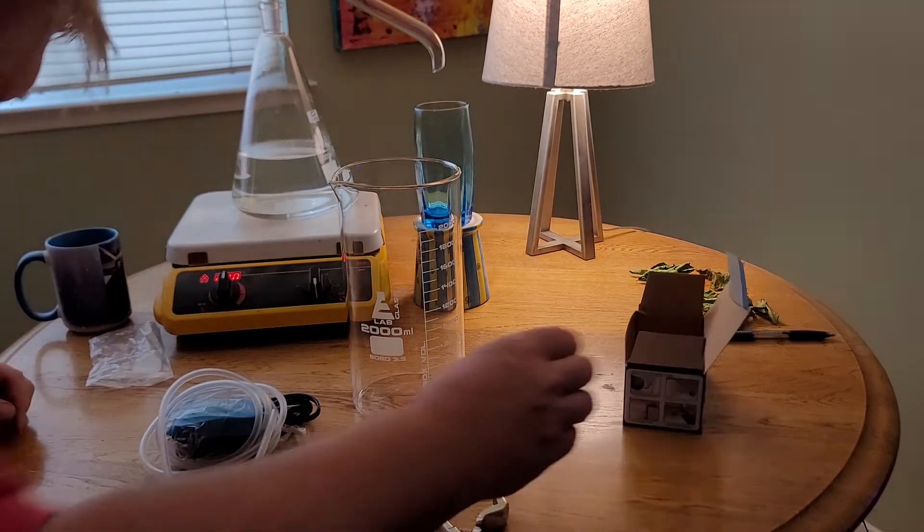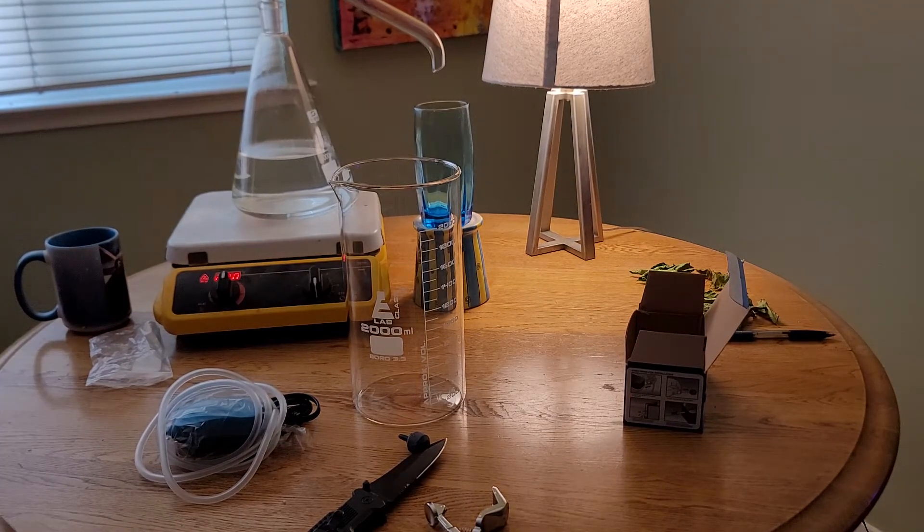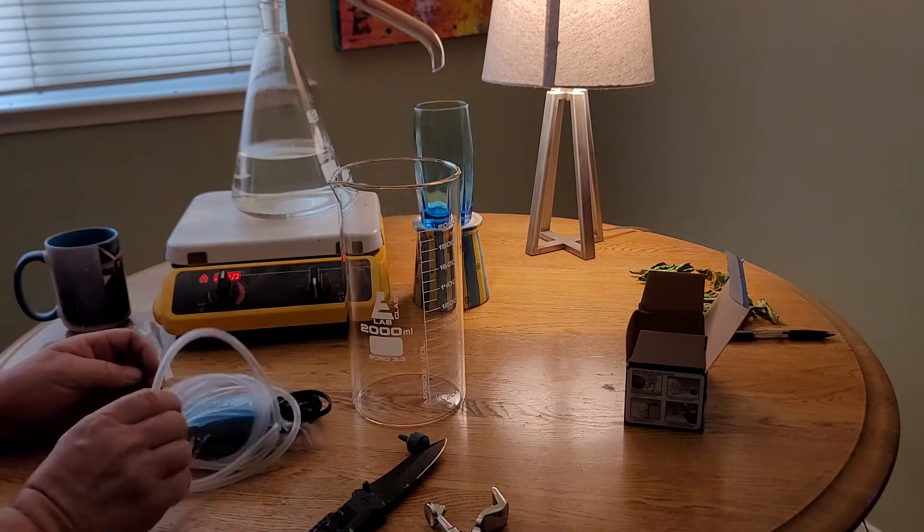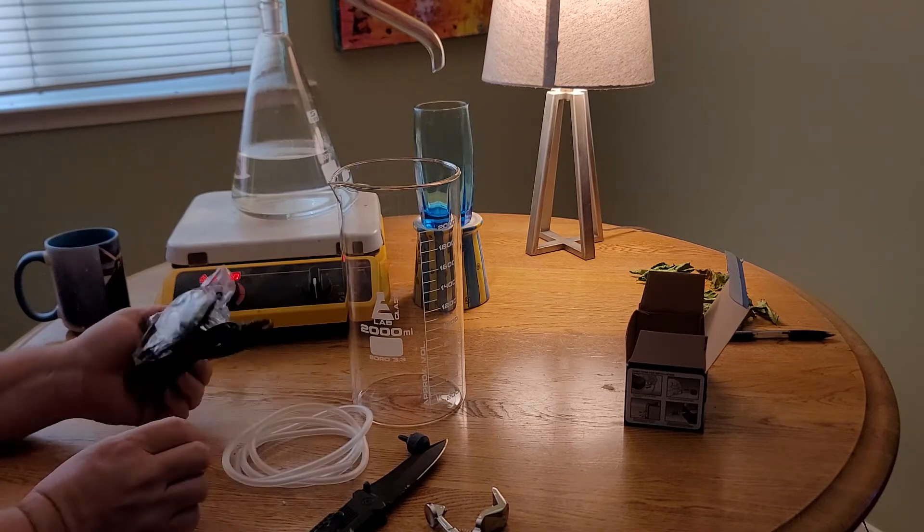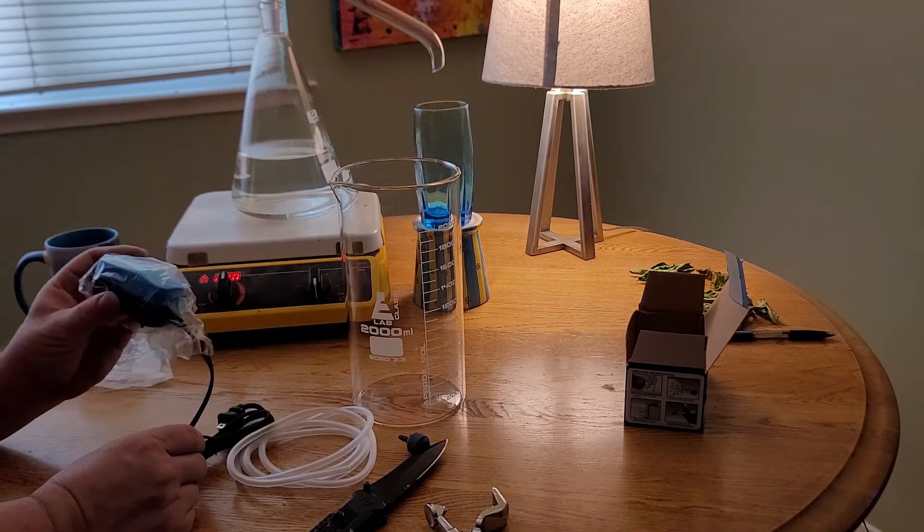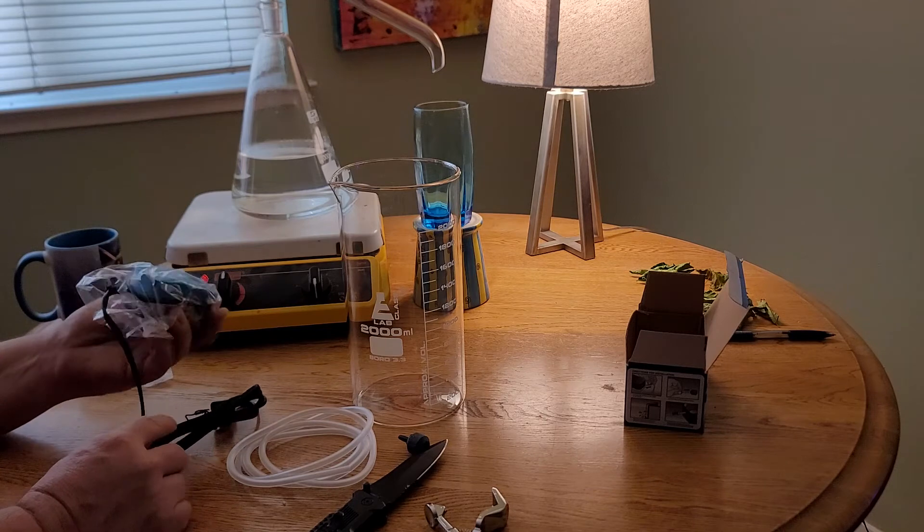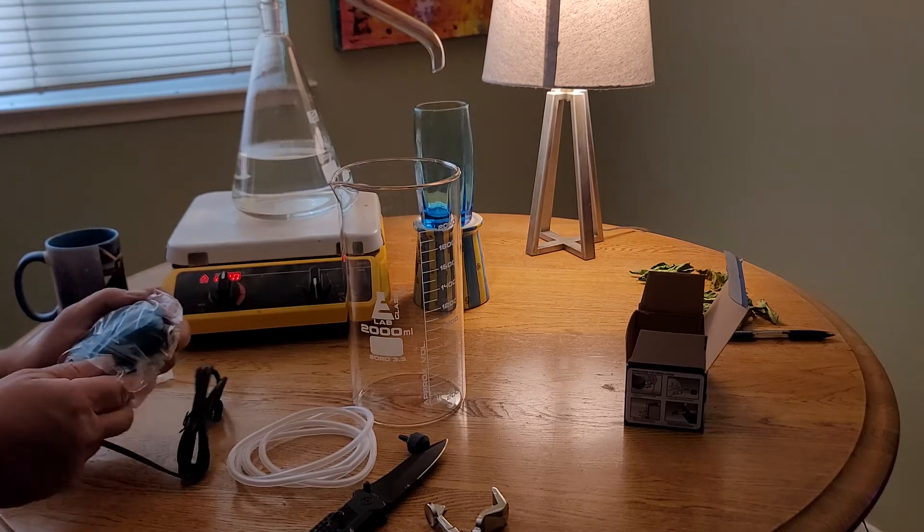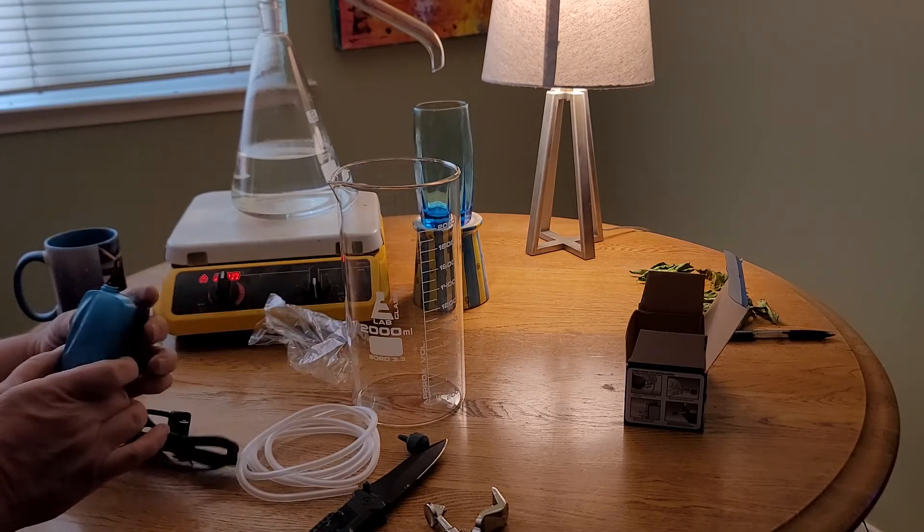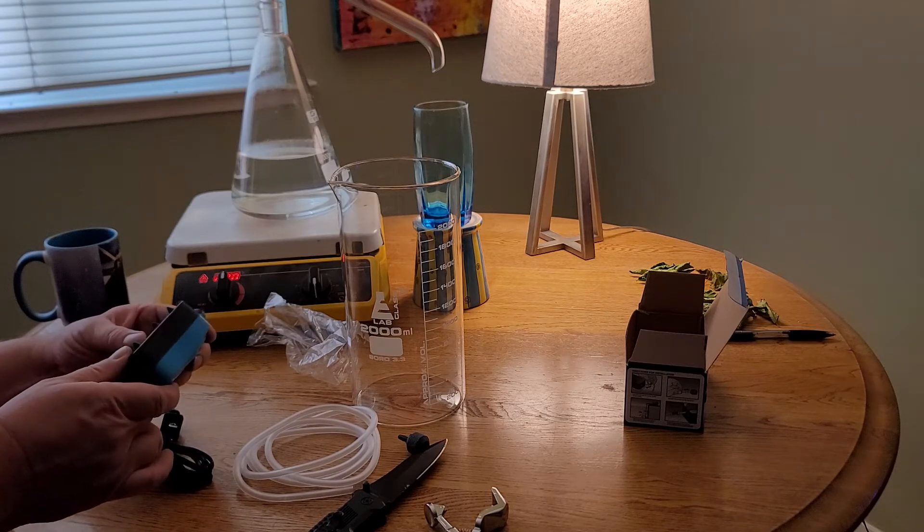Cool. This is a nice little pump. It was not very expensive. It seems like good quality for the price.